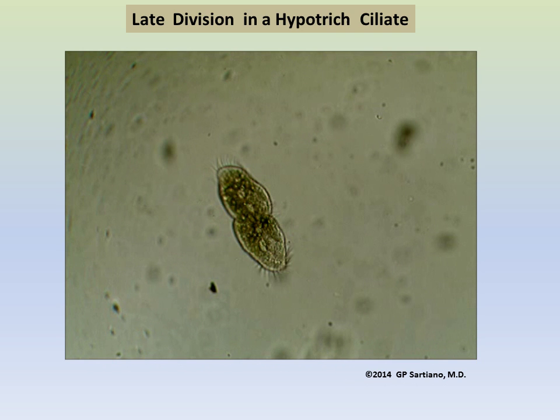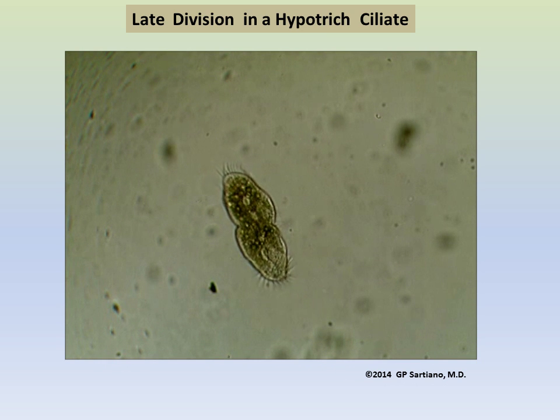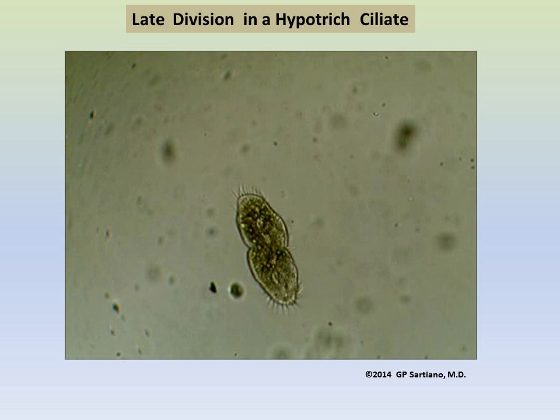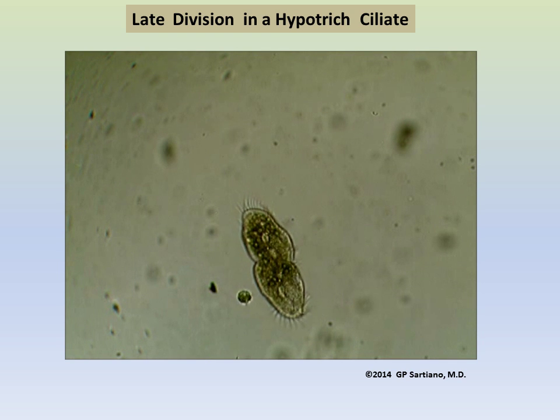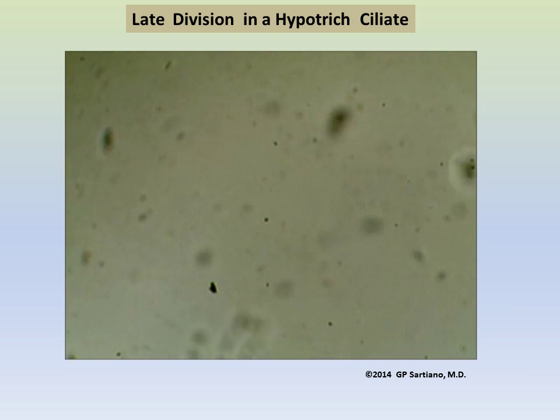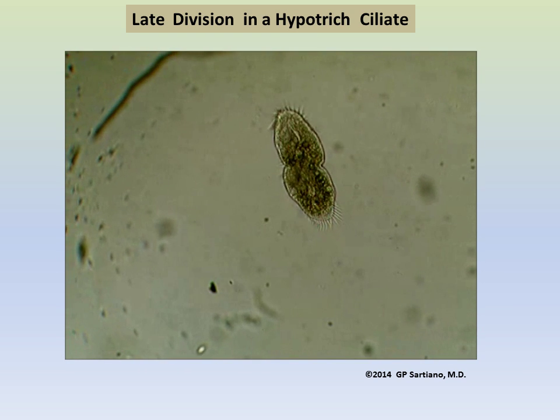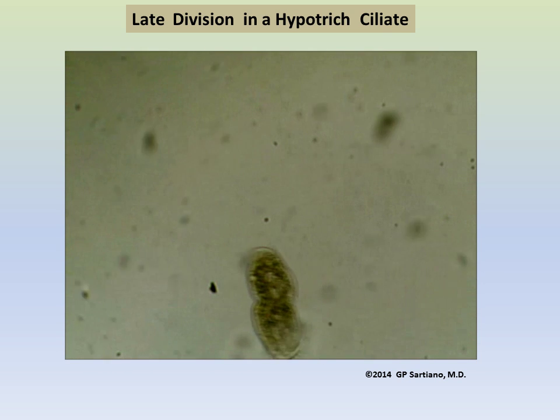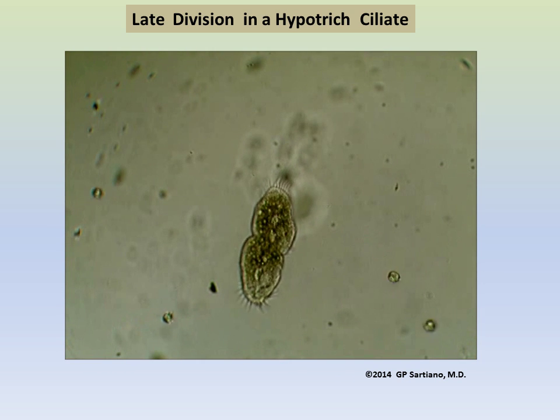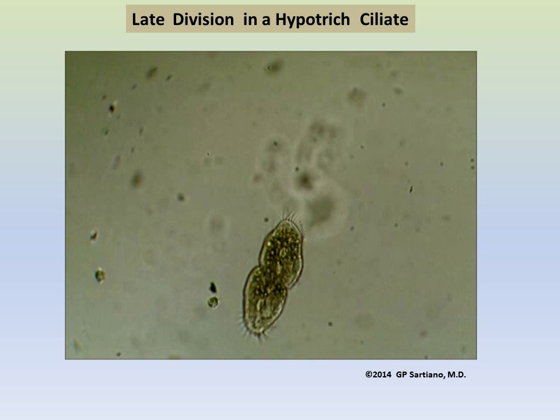As this process continues, the symmetrical development of the two product cells proceeds rapidly over a span of several minutes. It should be noted that none of this seems to have hampered any routine activities, such as cell movement.